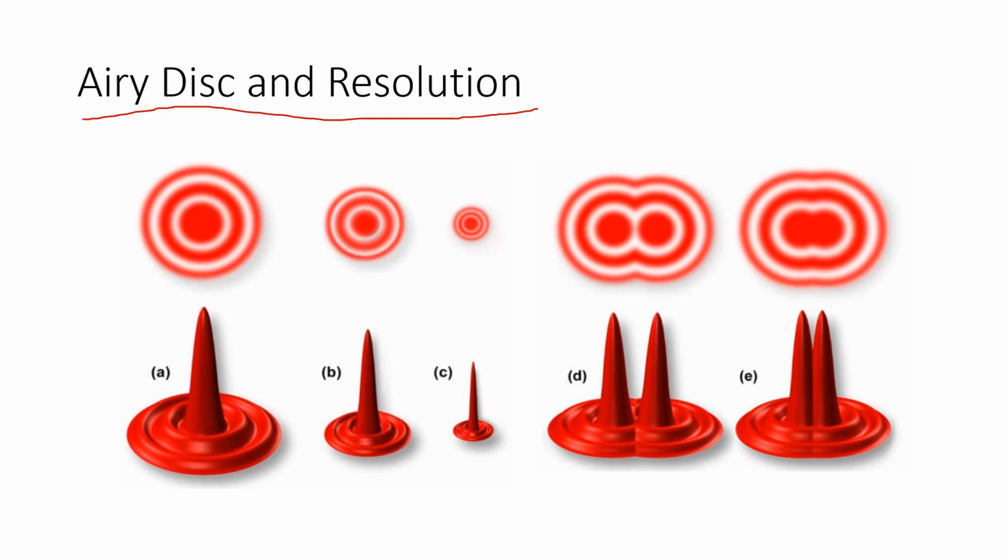At the eyepiece, after the image goes through the rear focal plane of the objective, it goes to the eyepiece, and there this airy disk formation happens. A large numerical aperture gives a smaller airy disk, whereas a smaller numerical aperture gives a large radius of the airy disk.